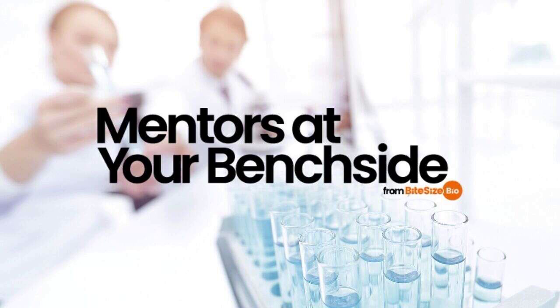But first, why is a visual determination of colocalization sometimes insufficient? While there are situations where you can determine protein colocalization visually, a more accurate confirmation of a mutual distribution of two probes is usually necessary to draw incontrovertible conclusions. Only when you collect images following a control protocol for colocalization analysis, with sufficient signal in each channel, no autofluorescence or signal bleed-through, is it safe to say that two probes colocalize solely based on observation.